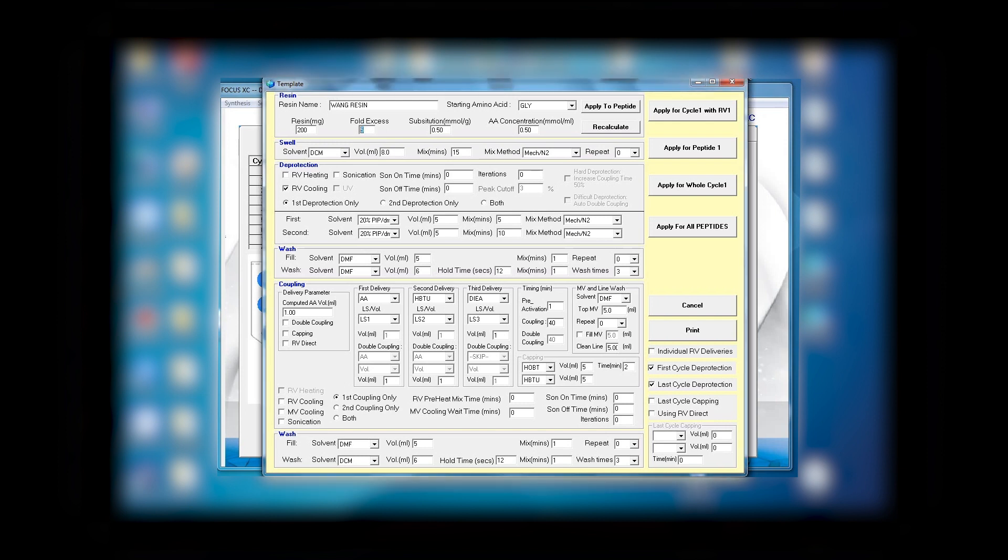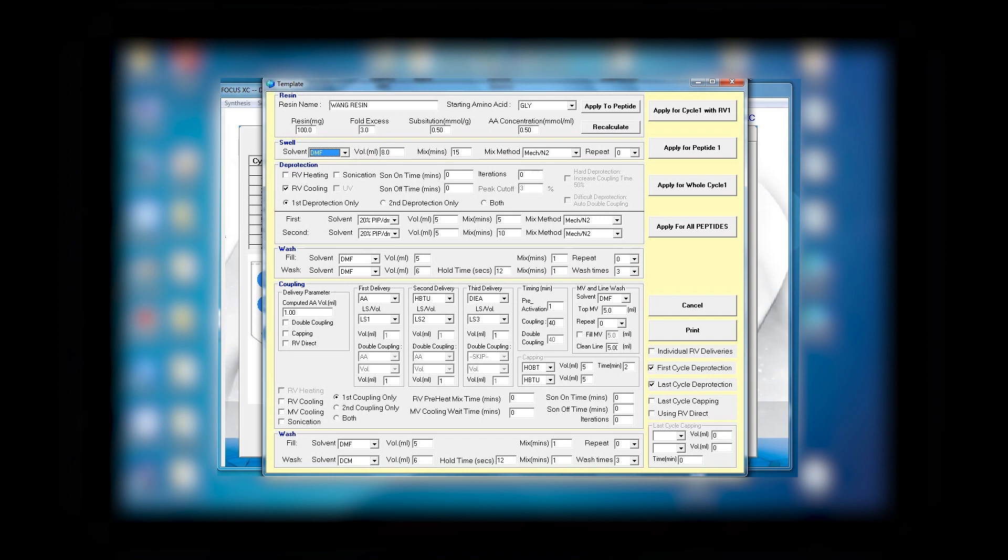You are using 200 milligrams of resin with a fold excess of five. You can change this to three, for example. You can also have 100 milligram of resin, for example, instead. Next you see substitution and amino acid concentration.